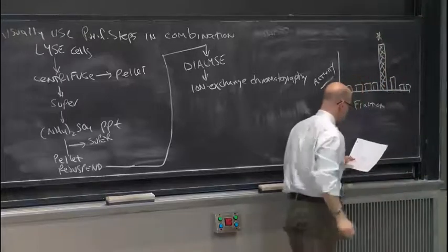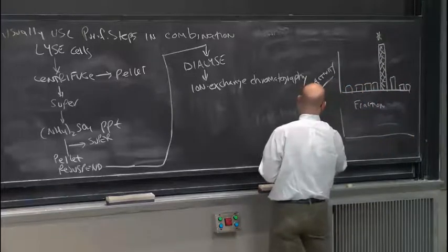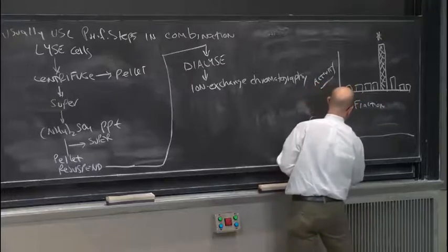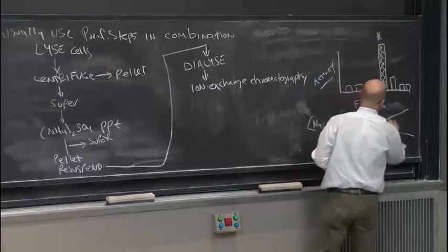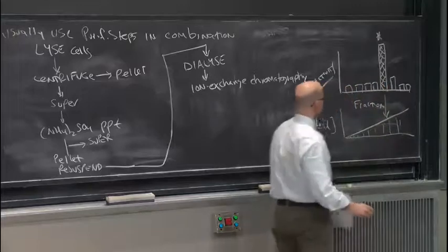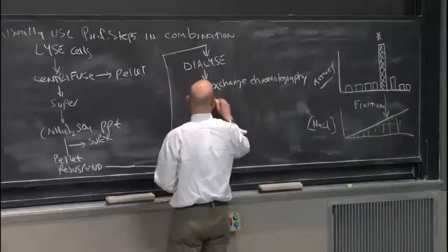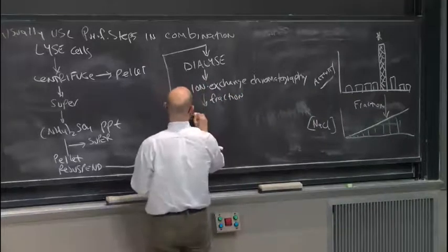So what do I do now, right? And remember, these are fractions that are coming off because I'm taking my ion exchange column and I'm increasing the ionic strength like this. So when I get to the right ionic strength right here, this is the ionic strength where my protein eluted off the column. So now I take my fraction that I'm interested in. I want to purify it in the next step. Now I might do gel filtration.